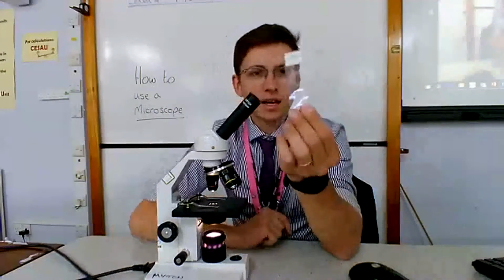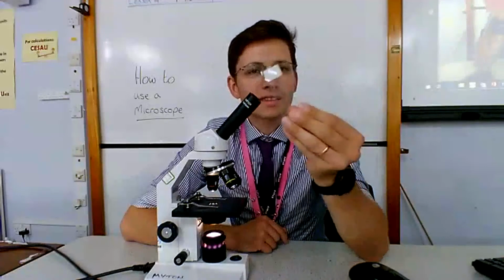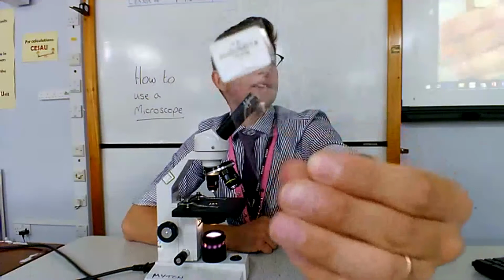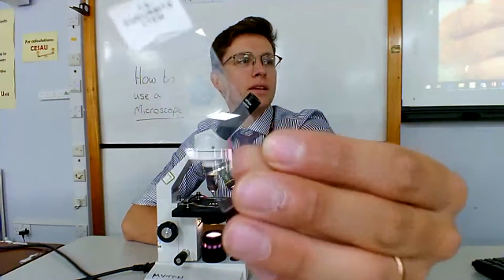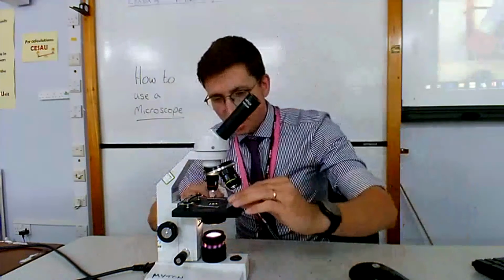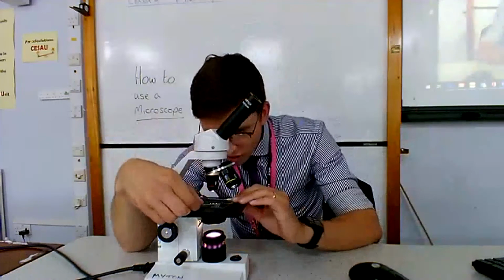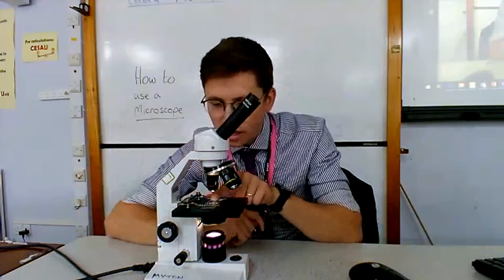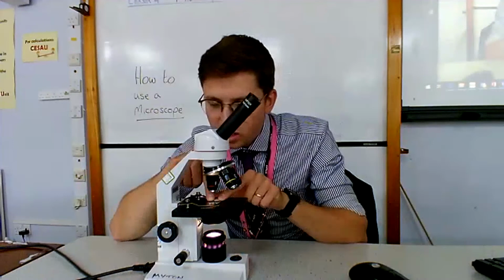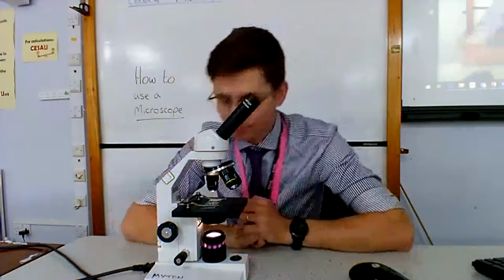So my specimen is here. They're very, very brittle, very thin glass slides, and you probably won't be able to see it on the video, or you might be able to, but you can see just a little bit of, this is a plant specimen on that slide. Okay, so that's what we're looking at. It's a very thin bit, and that goes underneath things called stage clips. Okay, so I'm going to put my stage clips on the top, and I'm going to arrange for that specimen to be right above this glass hole so I can see that the light's coming up through it.